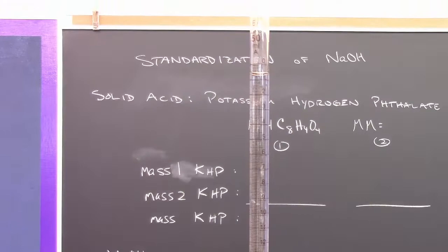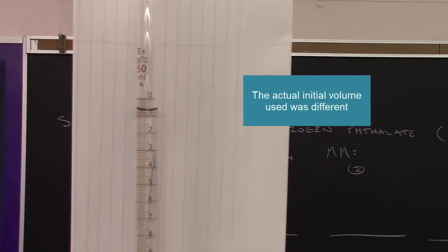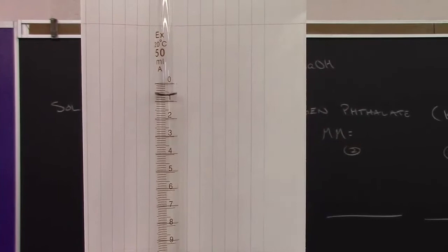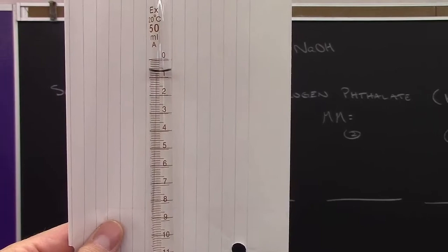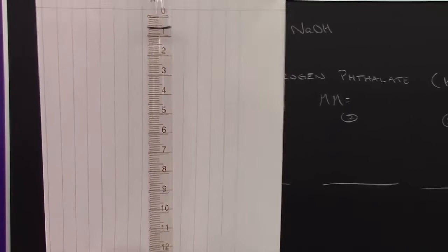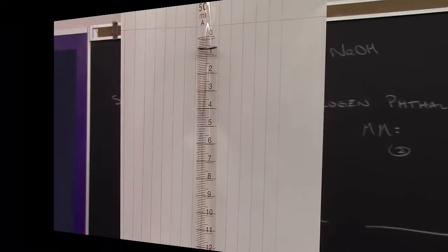My first volume, which I can use right now and put on my data table, is not at zero. It doesn't matter for two reasons. Number one, I'm actually kind of lazy and couldn't be bothered to get it to the zero mark. The other thing is, as long as I know the first volume and the second volume, I just subtract them and I will know how much base I actually used.